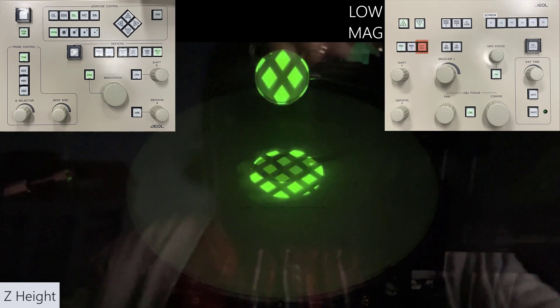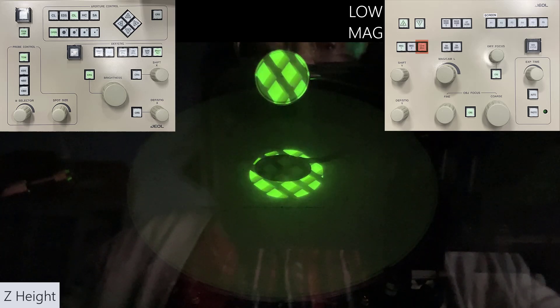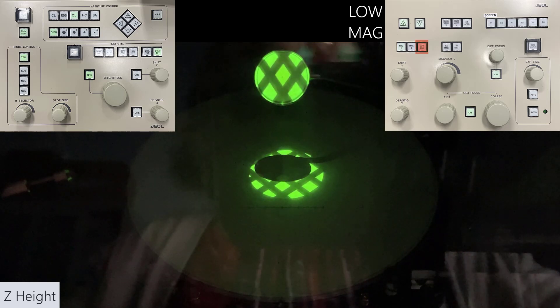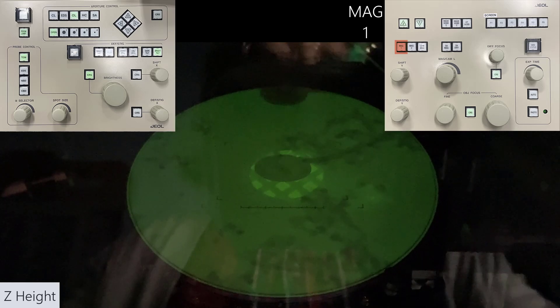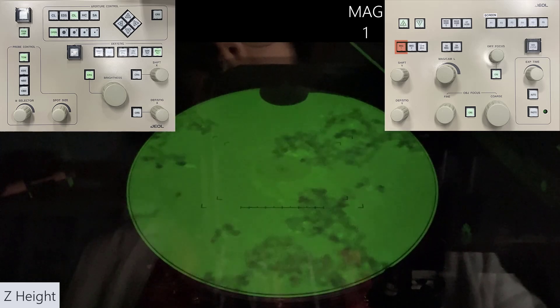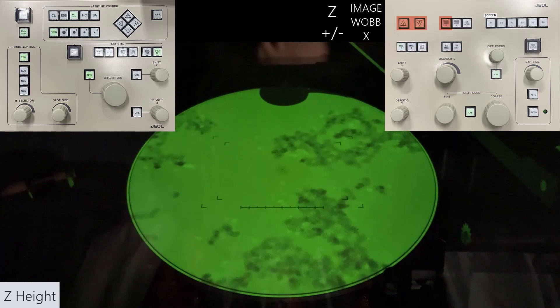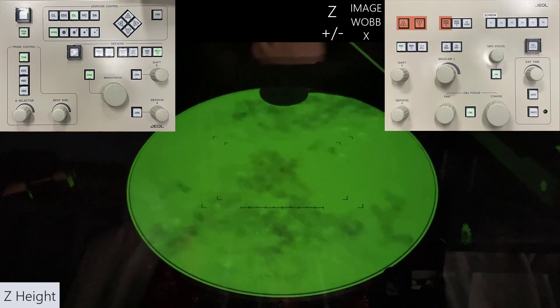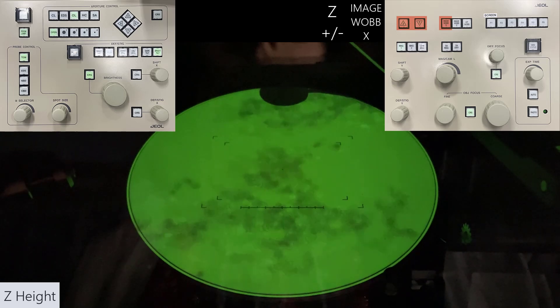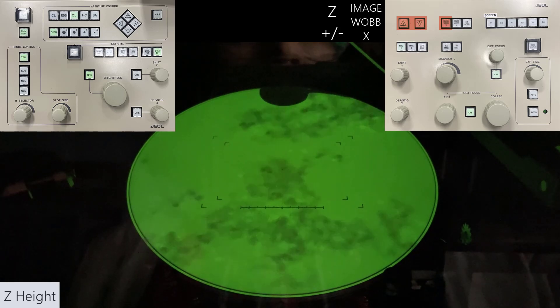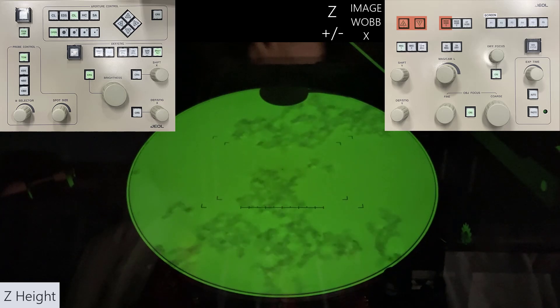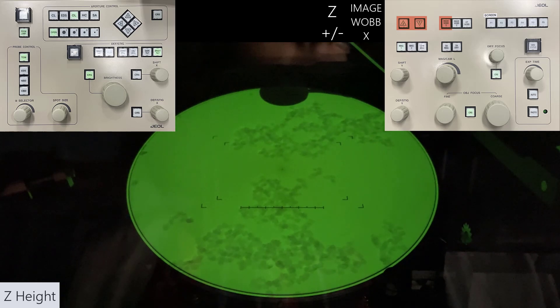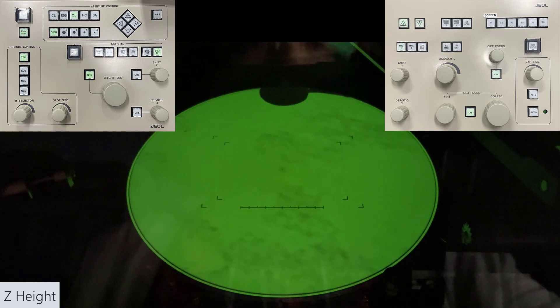Our sample's in here, so I'm going to go to low mag mode. I was sitting on a TEM mesh grid bar, so now I'm switching to mag 1 and I'm going to adjust the Z height of our sample. I'm going to do that using the image wobb X button and then adjust the Z with the plus and minus arrows. I want to minimize the wobbling — try going one way, and if it gets worse, try going the other. Now we're minimized, so I'm going to deselect the image wobb X button.